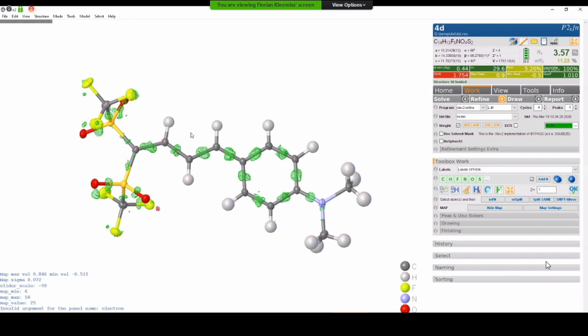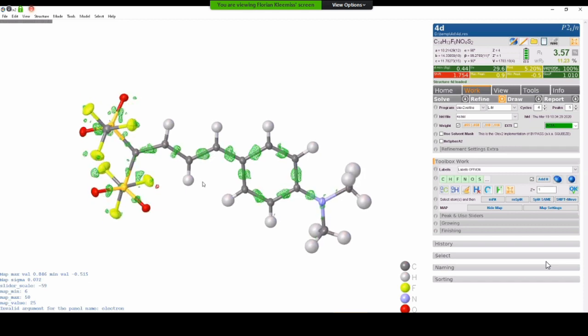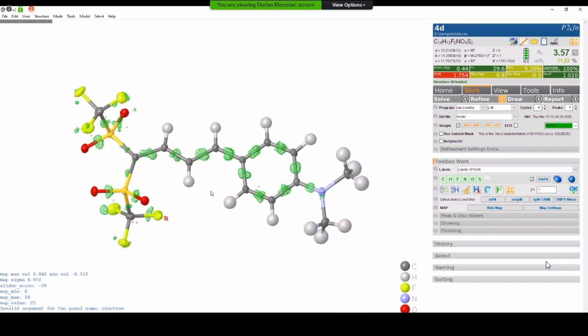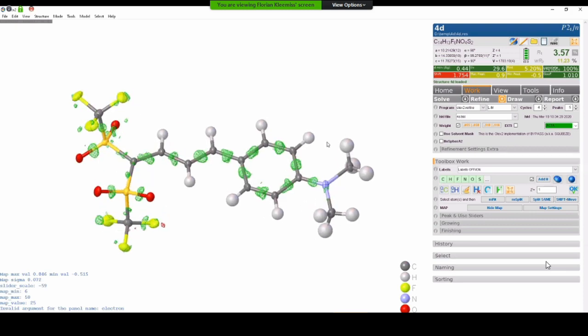So it's not very rigid, it's a diffuse atom shape, and this way we can describe additional features like bonding and polarization. In this way we can obtain better scattering factors for each individual atom, which are tailor-made to that atom in that very specific position, and then use them to do our refinements.